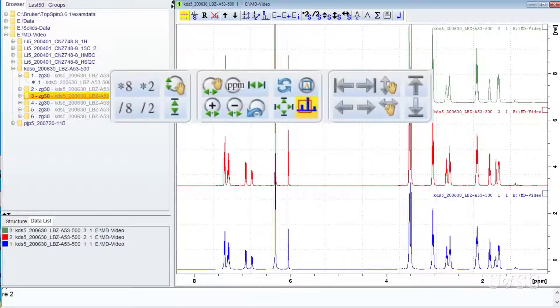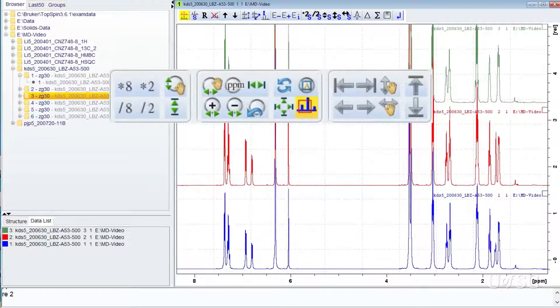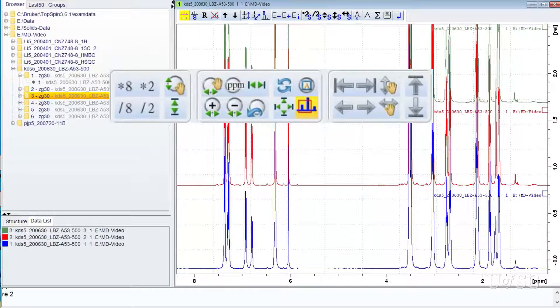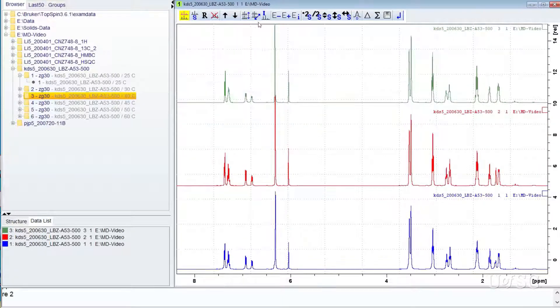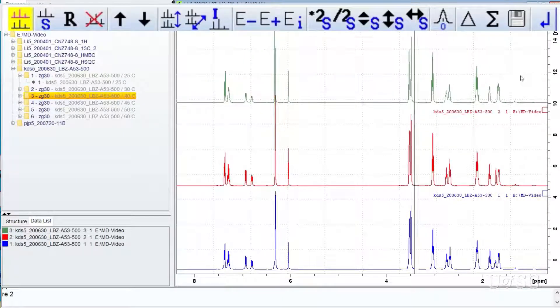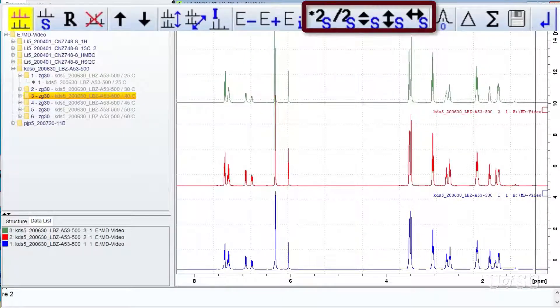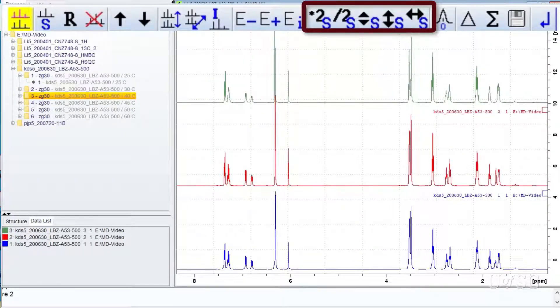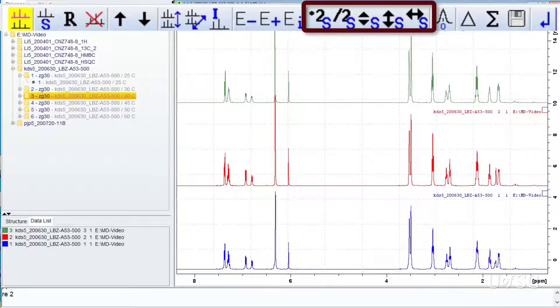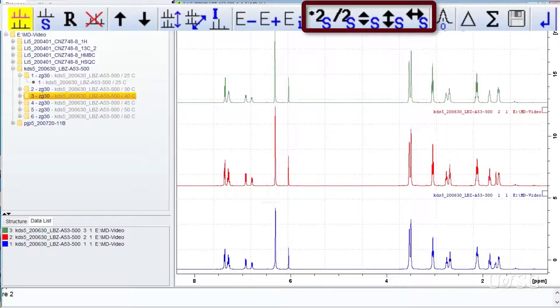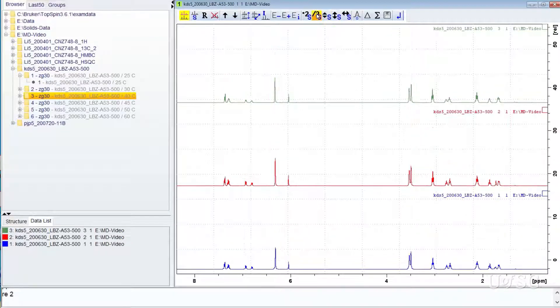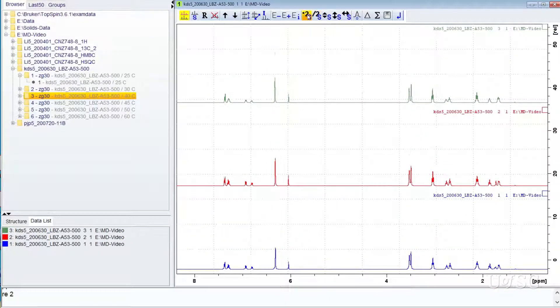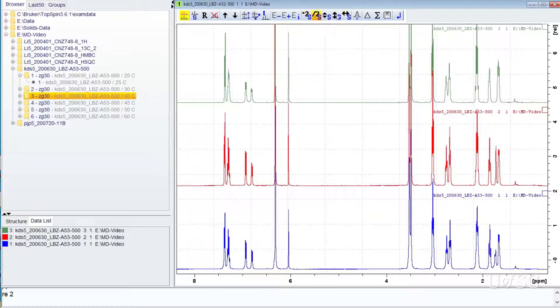The top button bar controls will always work on all spectra open in multi-display mode. A subset of these controls is also present on the multi-display mode button bar. When no traces are selected, these controls act on all the open spectra.